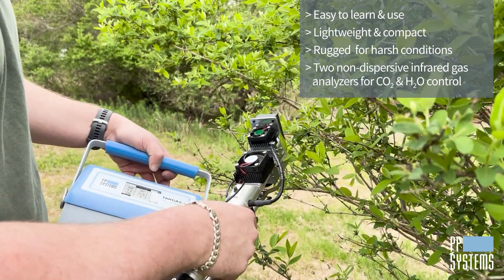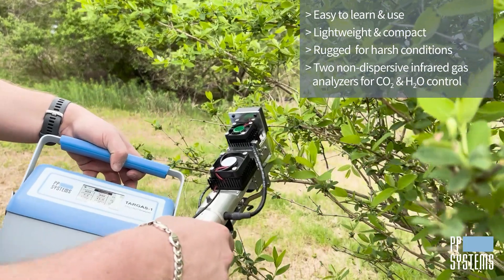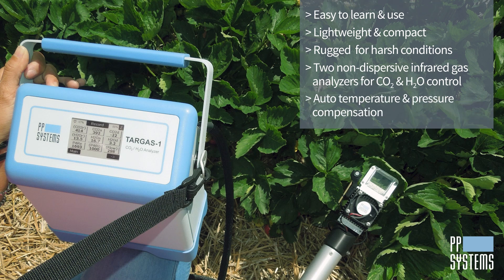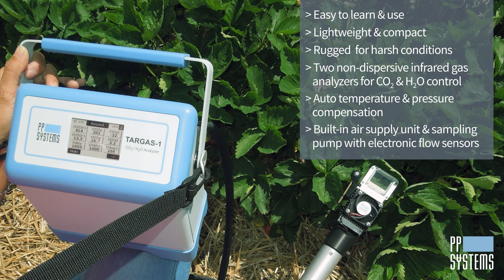Its two high-precision, non-dispersive infrared gas analyzers for CO2 and H2O ensure accurate measurement and control of both, and all readings are automatically corrected for temperature and pressure. An internal air supply unit provides accurately controlled reference air to the leaf cuvette.